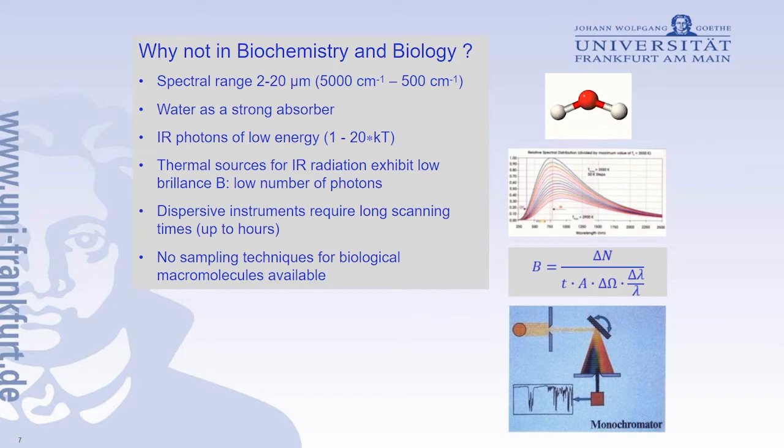Now, dispersive instruments require long scanning times. So my first infrared spectra that I took as a diploma student in the mid-70s took up to hours. You could easily start scanning a spectrum, take a coffee, have a meal, and then come back and you receive the spectrum. That became a lot different and faster in between.